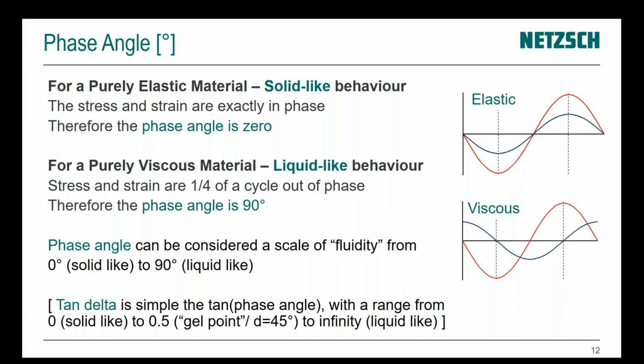Liquids flow, no big surprise there. We all know liquids flow, that's what makes a liquid. But to flow takes time. So what does that mean? Well, we measure a phase lag between the deformation we apply to the material and its result. So we get a measurable phase angle, a phase lag between the applied and the resultant signal. You can do this yourself. Think about putting your hand inside a fish tank and dragging it forward and back. As you push it one way, you feel the resistance to flow. That's viscosity. But when you pull your hand back, you can still feel the flow in one direction before it comes back the other way. Liquids flow, and to flow takes time. This time is a phase lag, which we measure with the rheometer. The software does it automatically for us, and it's called the phase angle.